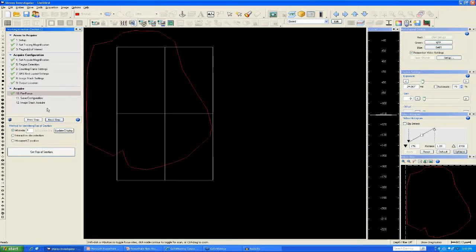In order to obtain SRS image stacks of your tissue from the top to the bottom Z position, it is important to indicate to the software the location in space of the top of your tissue. We recommend measuring at every acquisition site. In this way, you will have the most information about tissue top locations and have a greater chance of scanning and acquiring Z-stack images from the entirety of the Z axis.